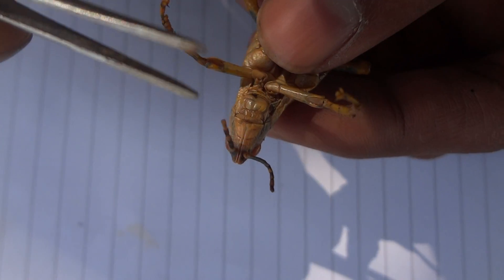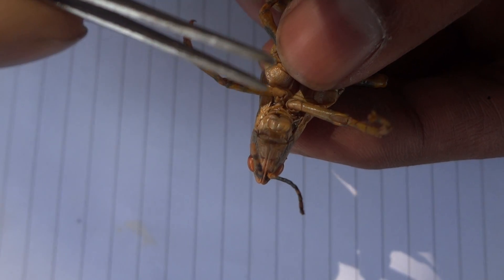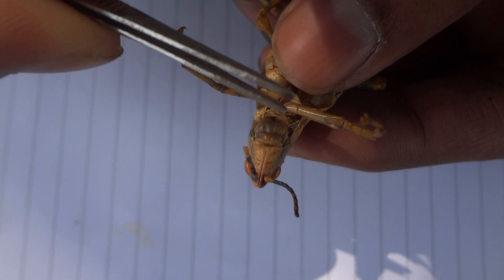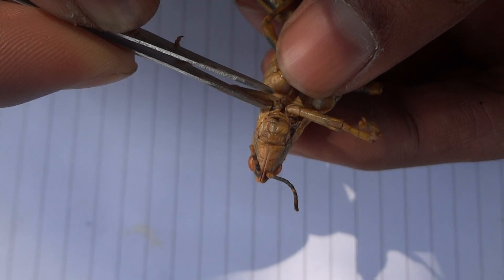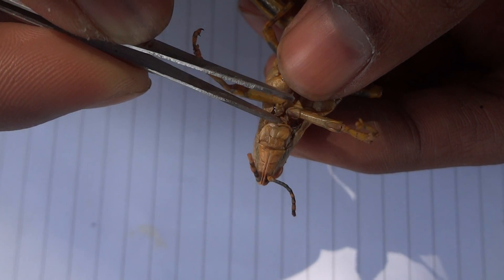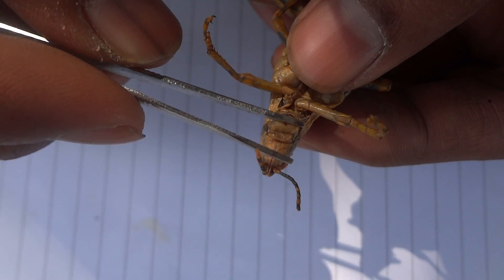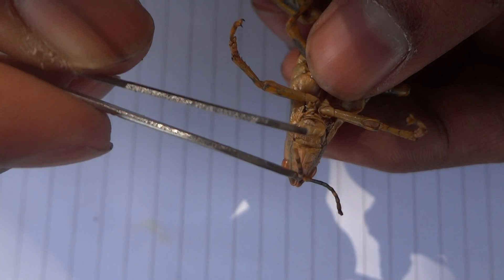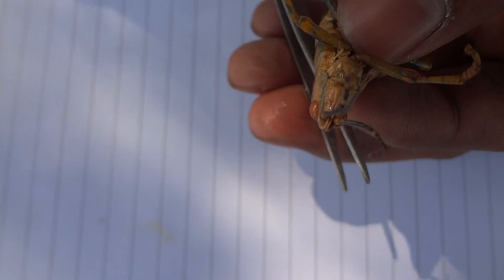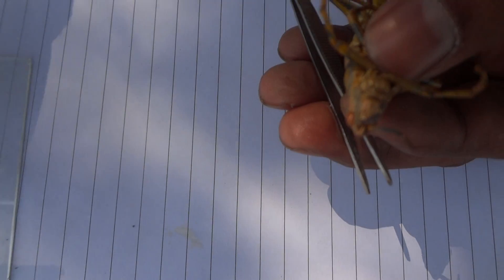The first part of the grasshopper you can see is the clypeus, and below the clypeus this flap-like structure is the labrum. Before dissecting the mouth parts, we should put some glycerin on the slides so that friction does not hinder our work or cause damage to the mouth parts.